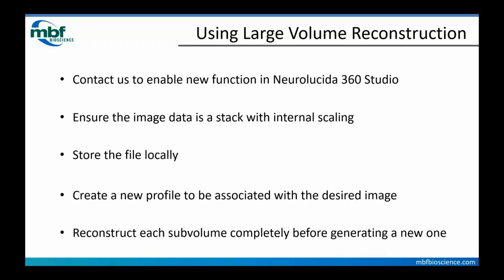And finally, we're going to recommend that you reconstruct each subvolume completely before generating a new one. This allows you to make the best use of those smaller bytes that you're taking at that individual resolution, that high native resolution, and it streamlines the process. You don't have to remember where you need to go back to.